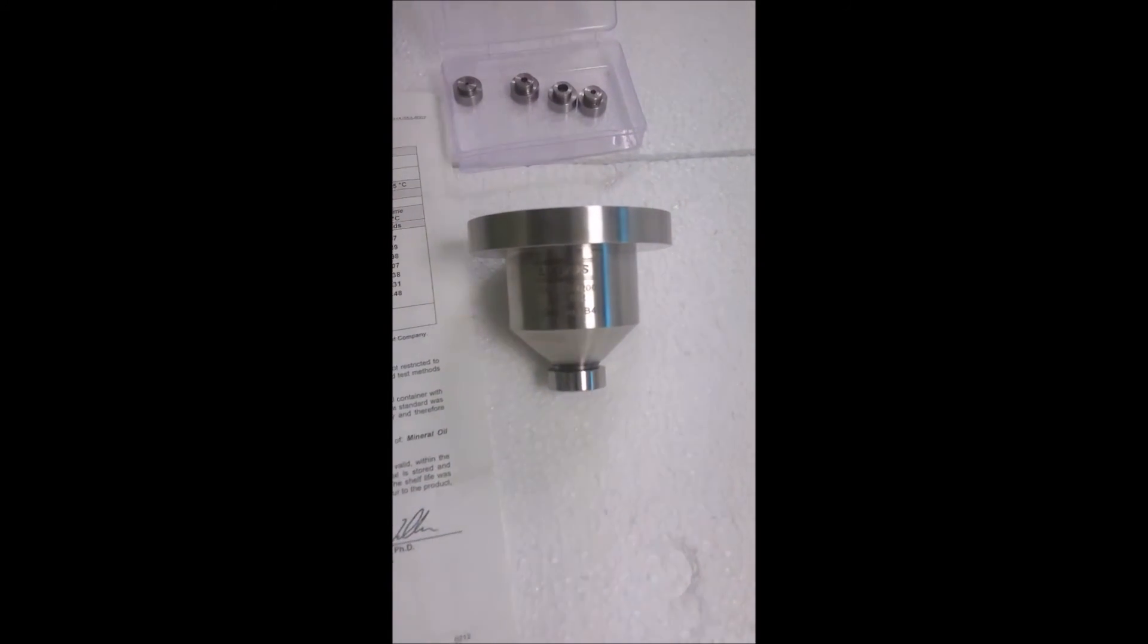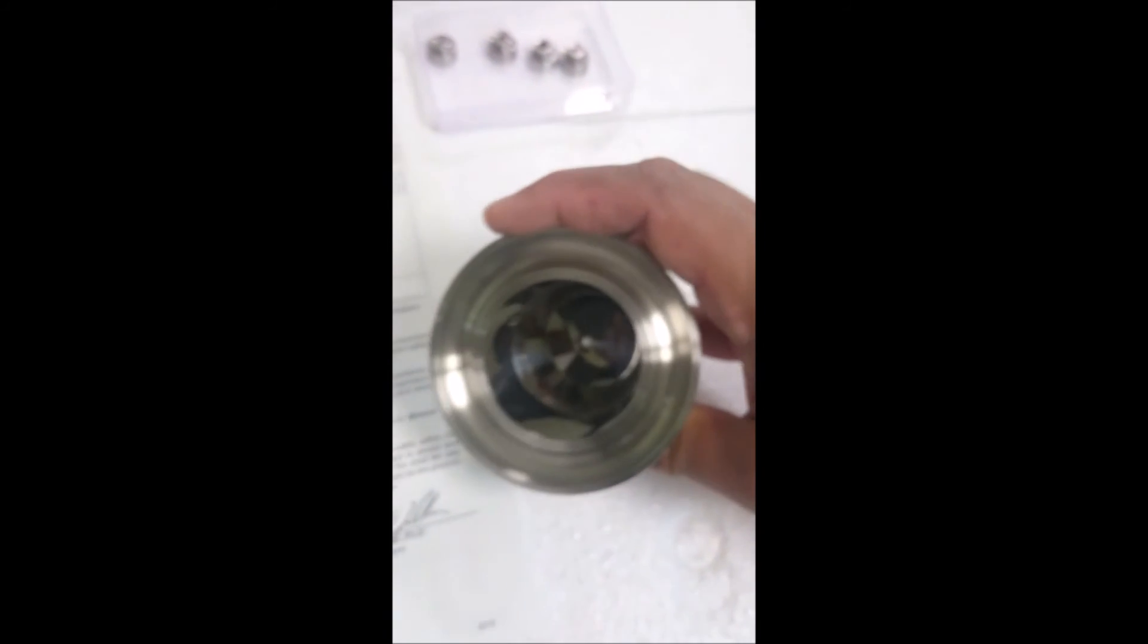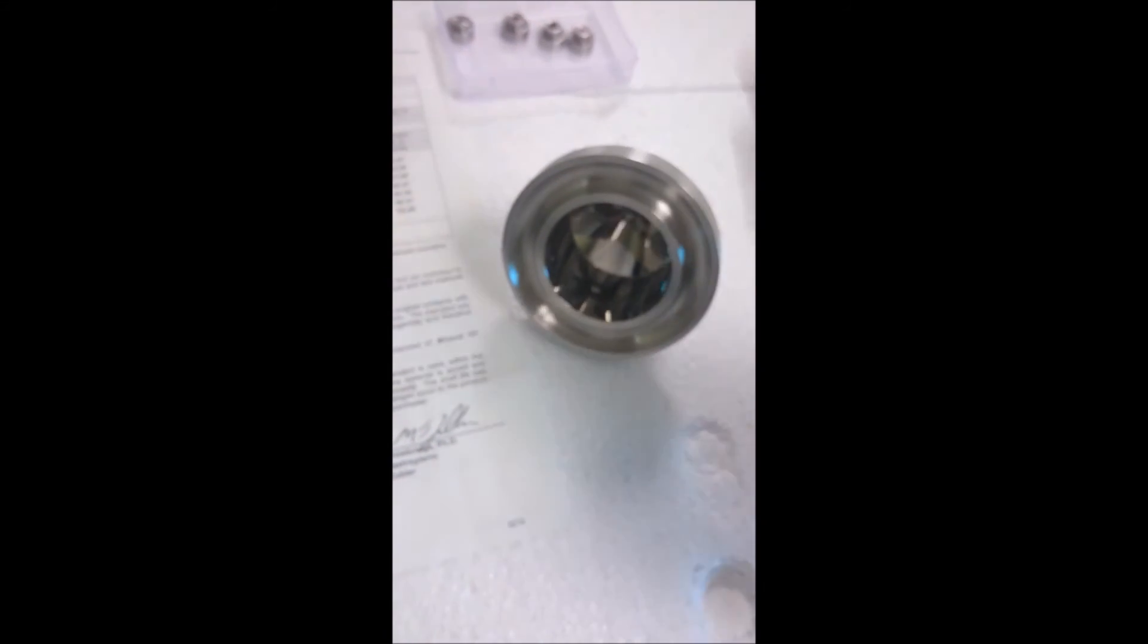At Lloyd's we manufacture viscosity cups as per ASTM D1200, popularly known as Ford viscosity cups which are calibrated to traceable international laboratories.